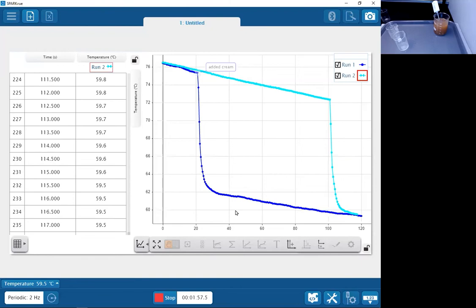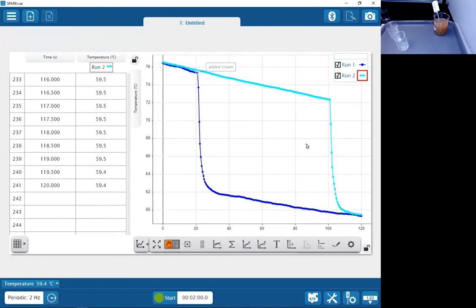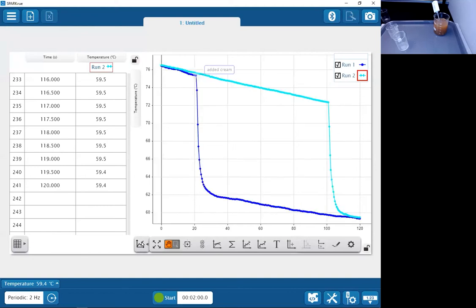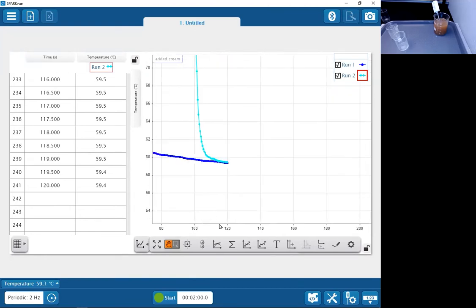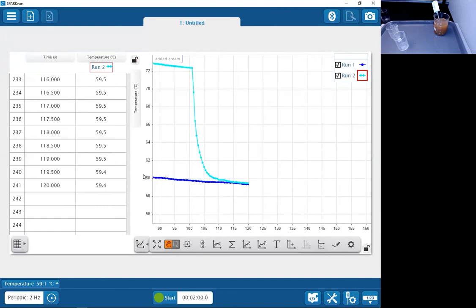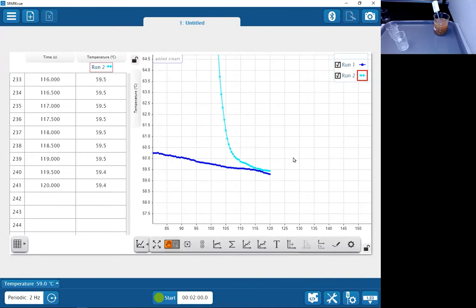Very close here. All right. So the stop condition happened automatically. And if we want to figure out what happened here at the very end, we might want to go in and pan over and use our scaling. All right, so might have been too close to call here.